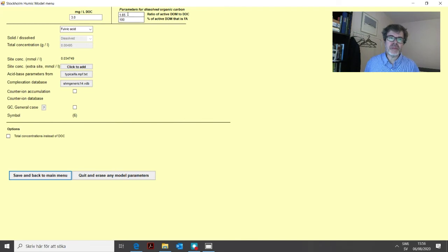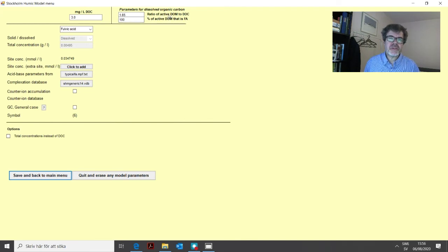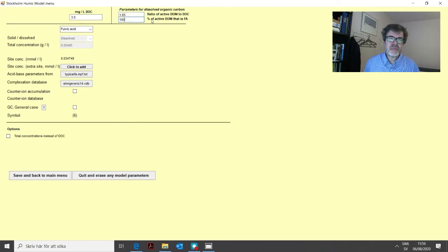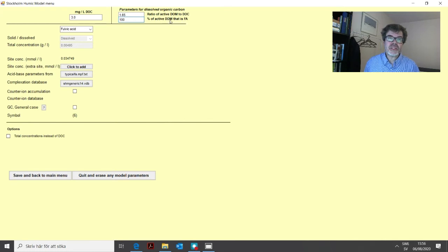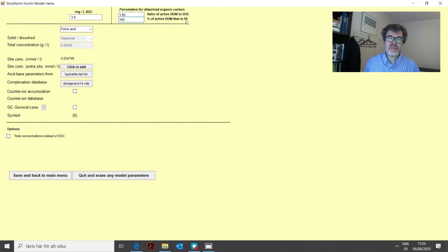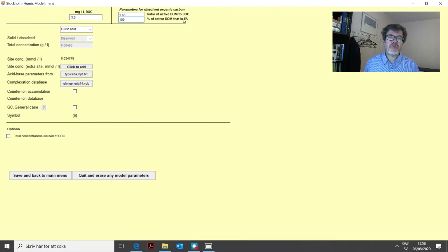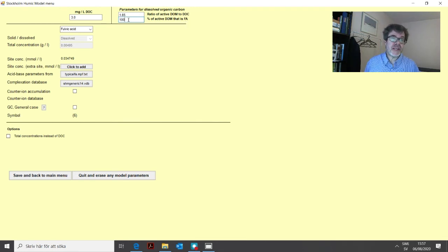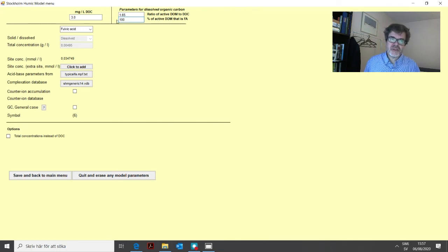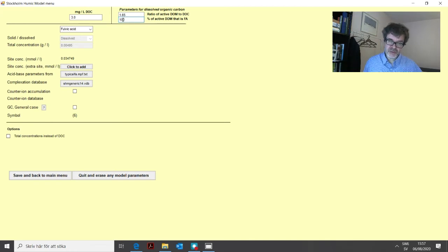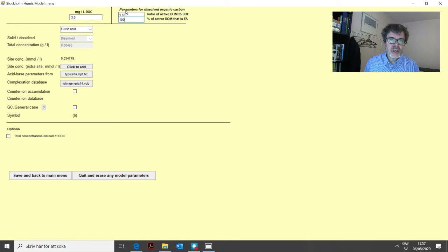But if there is one parameter that you might want to change sometimes is these two up here. The first one is ratio of active DOM to DOC. That is 1.65 and the second one the percent of active DOM that is FA. DOM is all organic matter. FA is fulvic acid. So this means basically all of the DOC that we have in the water, we assume that to be fulvic acid or at least the part that is active and we don't have any humic acid in the water. We can change this to another value. Let's say if you have 80% here it means that 80% is fulvic acid and 20% is humic acid.